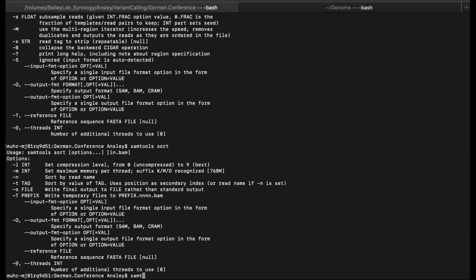So we're going to type in Samtools space view. We're going to use the -b flag. We're also going to use the -S flag just so that it auto detects the format. It just saves time. We're going to put our input SAM file. So if we remember correctly, that was my SAM file. And we're going to use this straight line over here.